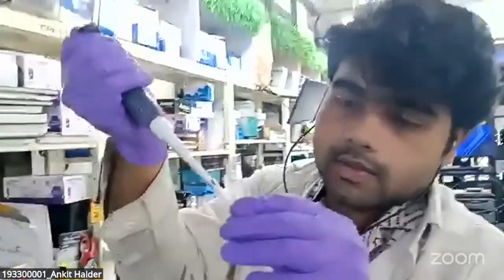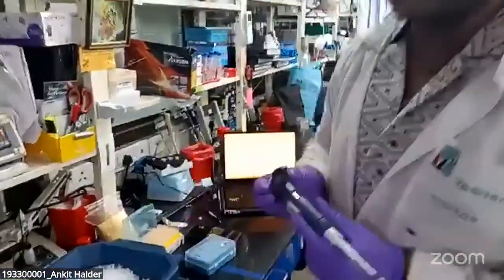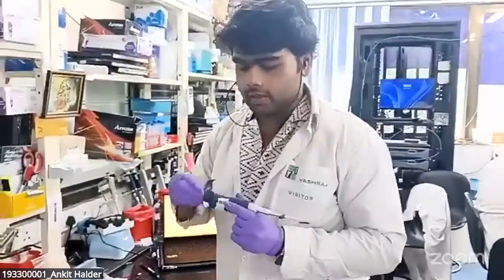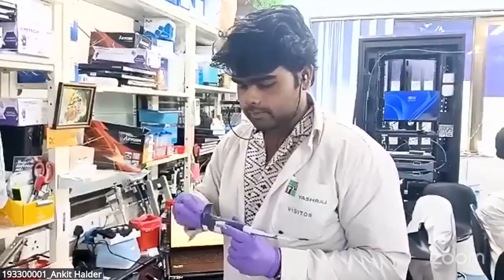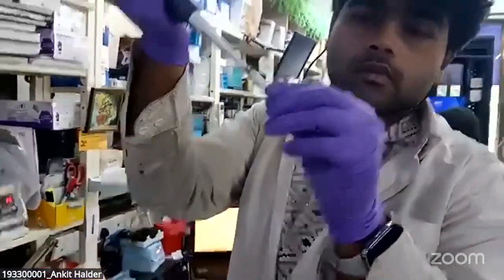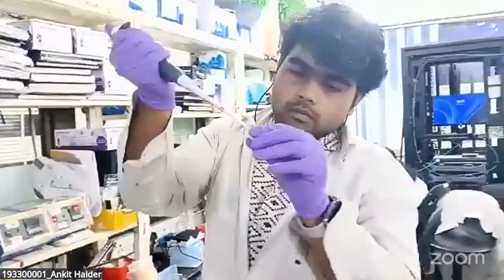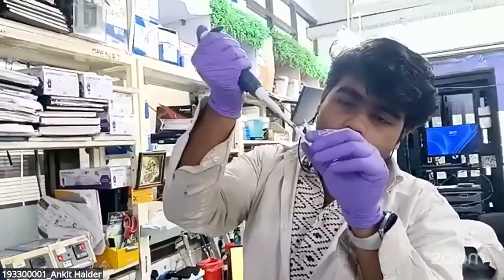Here we're putting the samples. Now we need to make the volume with the help of buffer B. We need to make the volume up to 20 microliter. So 20 minus 3, that is 17 microliter of buffer B we need to put. We will keep the buffer B here. I will mix it well.